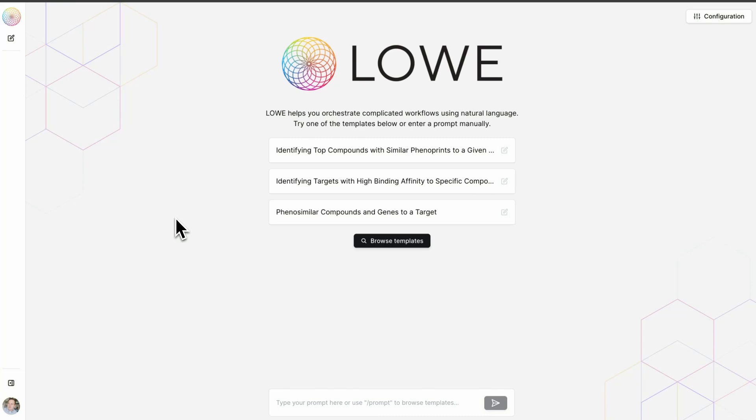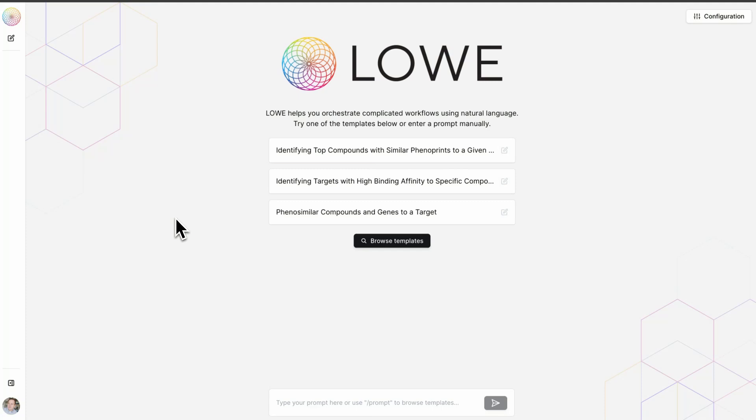Over the next seven or eight minutes, we will demonstrate the approach by starting a mock drug discovery program together. What could take months or years in a traditional setting can now be done in weeks or months thanks to massive proprietary omics datasets spanning the genome and billions of compounds combined with powerful ML and AI-based tools.